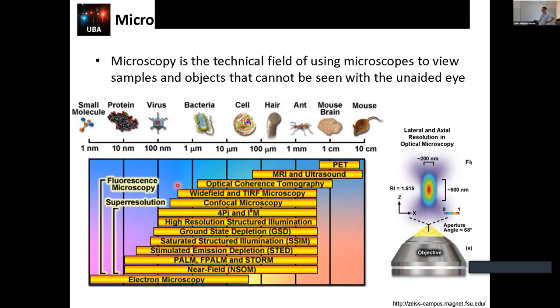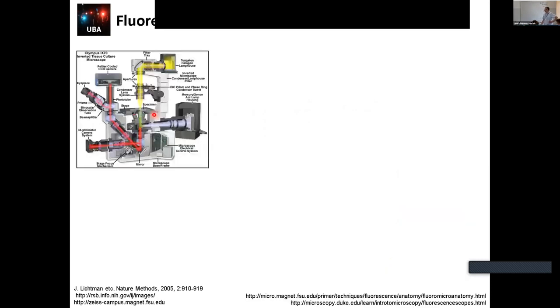And basically all of them were tuned in different ways. But to make a summary of the resolutions, we can say that wide field and confocal microscopes can cover from millimeters to hundreds of nanometers. And this limit, this barrier of resolution, was broken with super resolution. On Wednesday, we will have 3 experts in the field giving all the details about how they did it and how they are pushing these frontiers day by day.